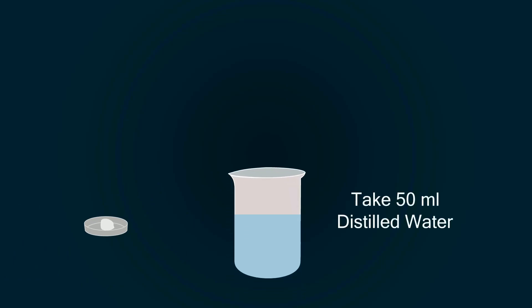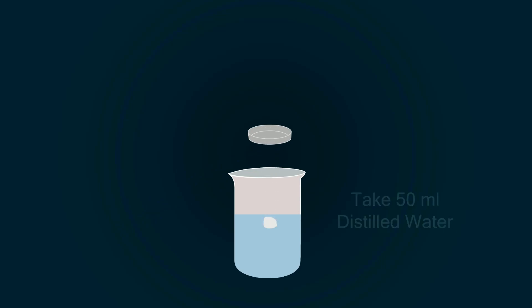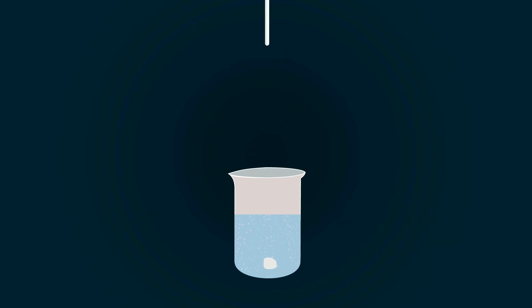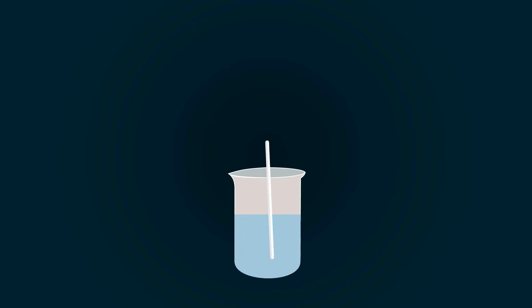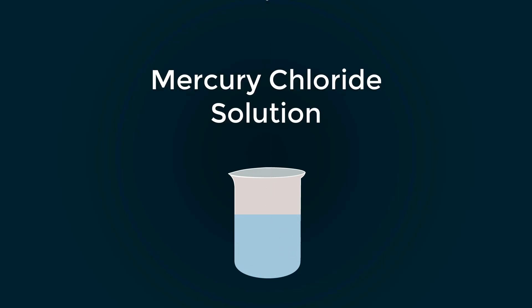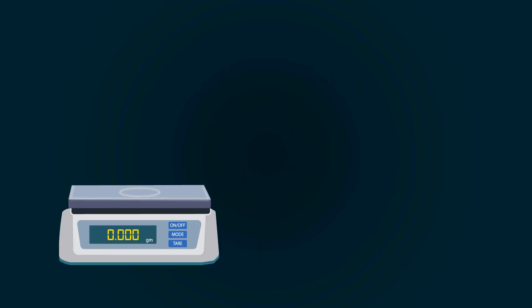Take 50 milliliters distilled water into a beaker. Put this chemical into distilled water. Dissolve it with the help of glass stirrer. Mercury solution is ready.